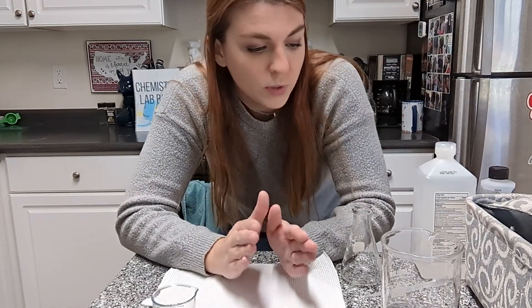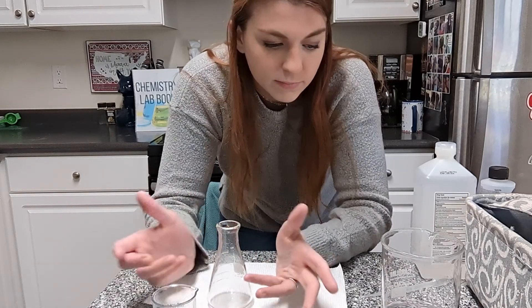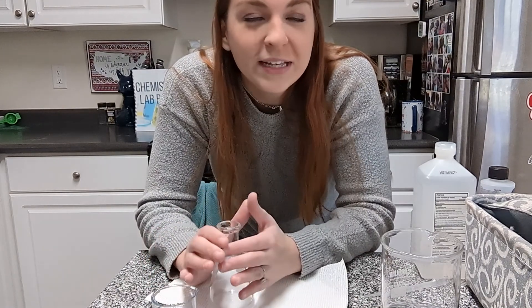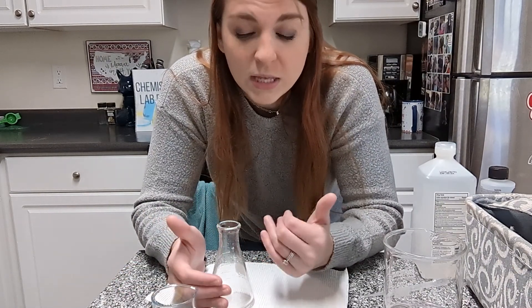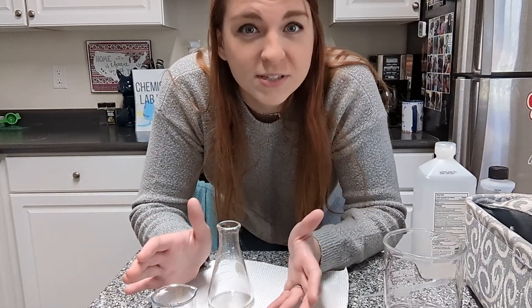It's super important to be careful with what chemicals you actually use here. Mixing household chemicals with water typically is not going to be a problem, but you should still check the SDS sheet on all of these chemicals just to make sure. The real issue is going to come from your waste beaker — if you are just dumping all of this into a holding beaker, you're going to have a bunch of chemicals accumulate. Even just dumping them down the drain, some of them should not go down the drain, and others should have water run behind them so that you don't have one chemical interacting with another inside your drain. So make sure to read the SDS on all the chemicals you choose to mix with water for this lab.